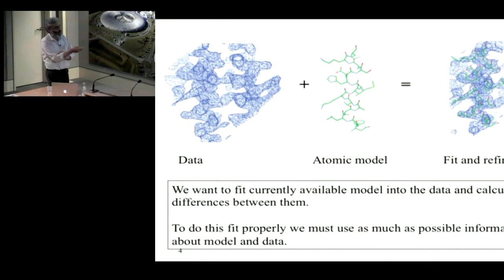At the moment, in fitting against cryo-EM maps, we do not use so-called difference maps and updated maps, so you always have to consult the original observed maps.